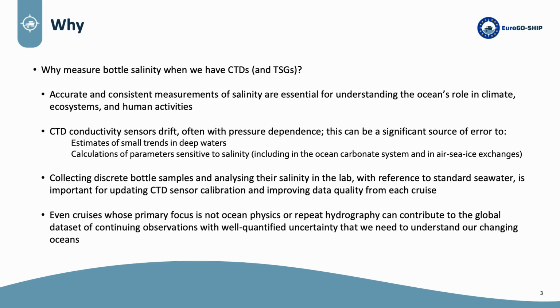Some projects have a focus on ocean hydrography and measuring physical processes, so calibrating salinity with bottle samples will be a default there. But many other projects, for instance fisheries cruises, also measure salinity as part of the background to the observations that they're primarily focused on. And one of the aims of EuroGO-SHIP was to outline how the quality of all sorts of ship-based data can be increased to improve the overall data set available. And calibrating salinity is one way, and that's something I'll come back to.